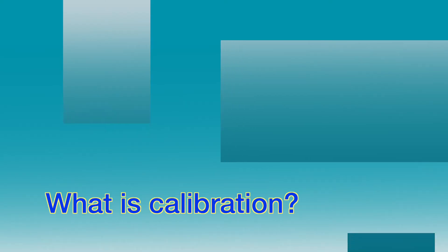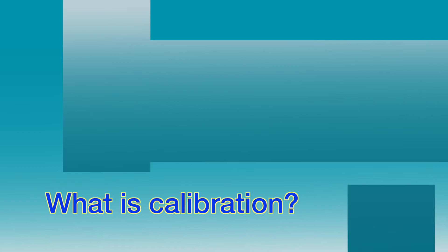So what is this calibration? The software inherently measures everything in pixels. The process of calibration involves basically telling the computer how many microns are within a pixel, and we do that for each of the lenses we're going to use.